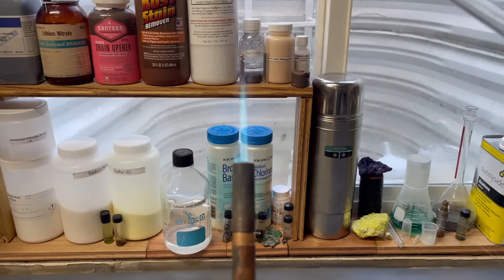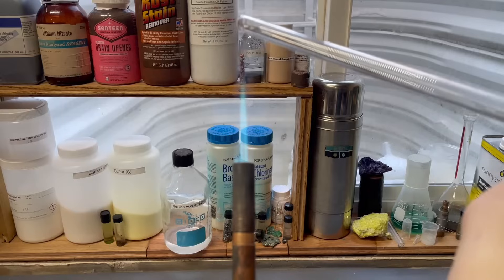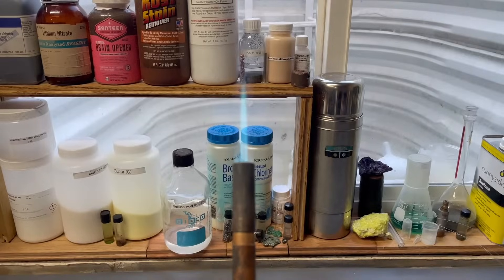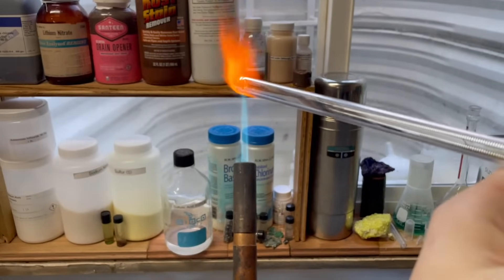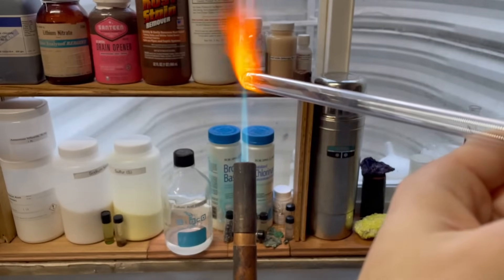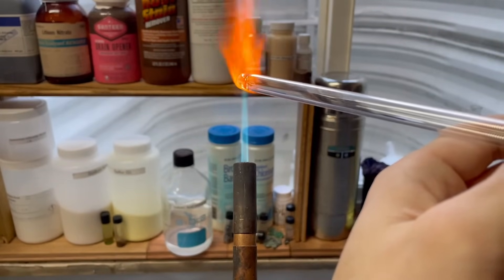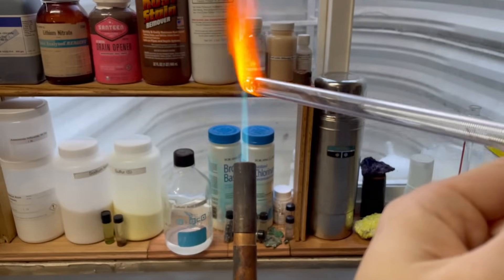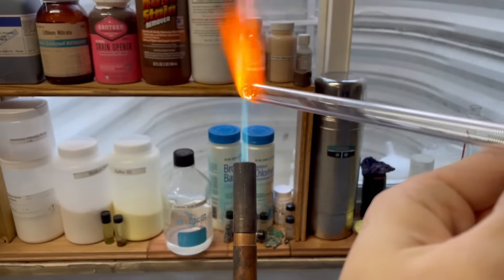Take the glass rod and slowly bring it into the heat so as not to thermally shock it and cause it to crack. Remember to constantly spin it to evenly heat it. Now that we have a large molten glass bead at the front, let's switch hands and use the right hand to grab the pliers and pull it off.